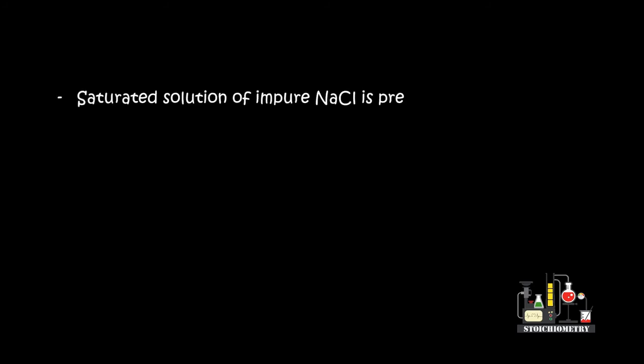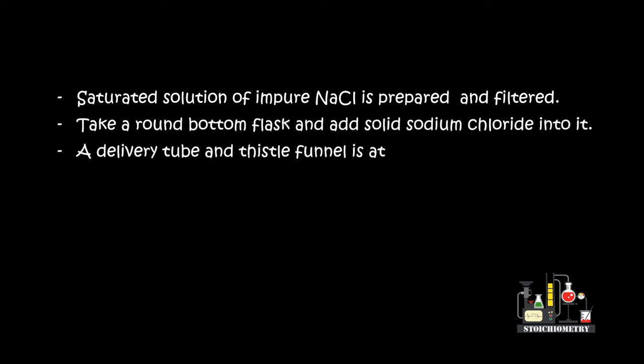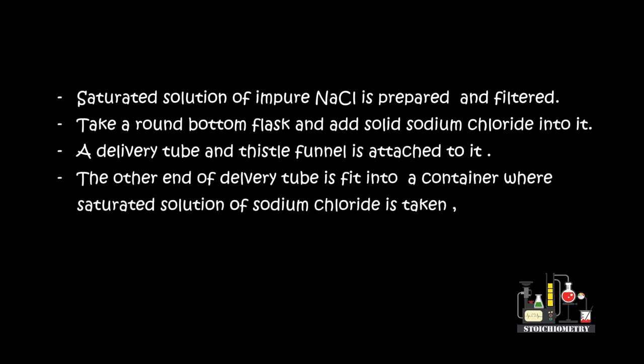The procedure of the experiment: a saturated solution of impure sodium chloride is prepared and filtered.